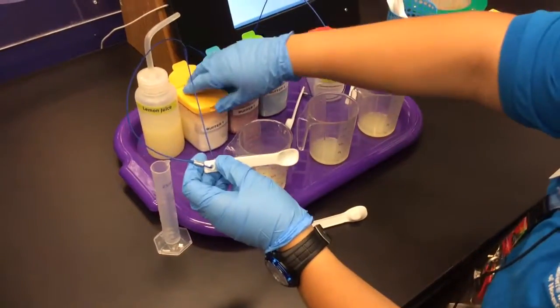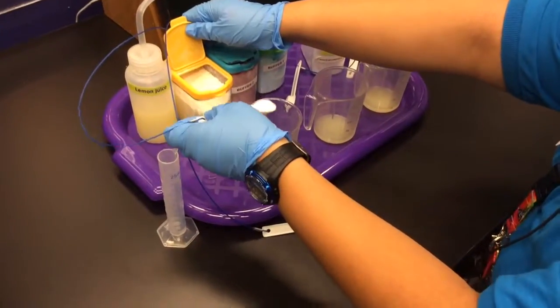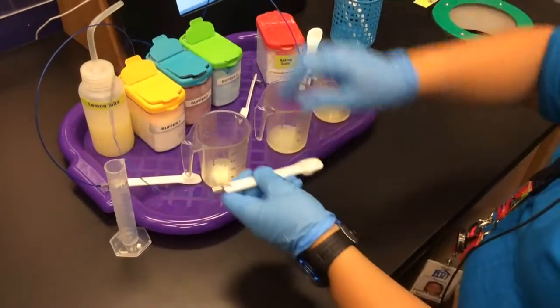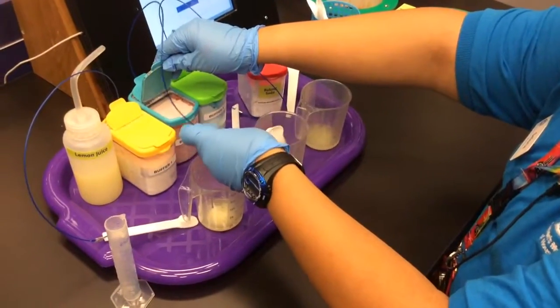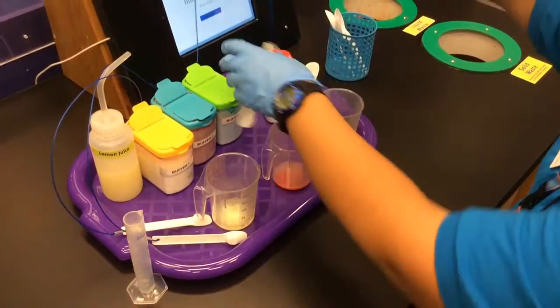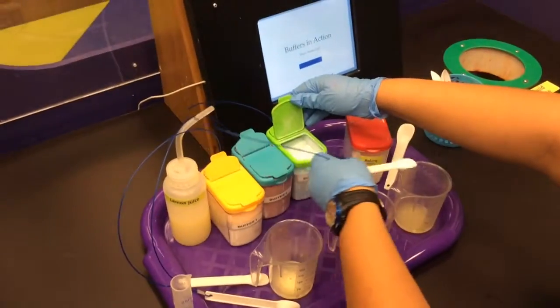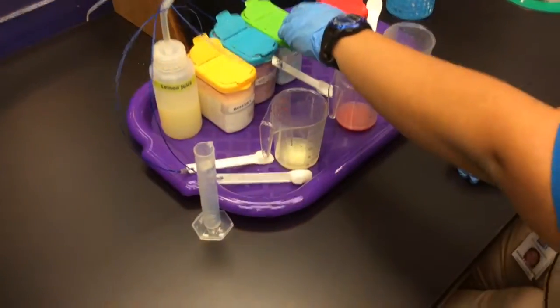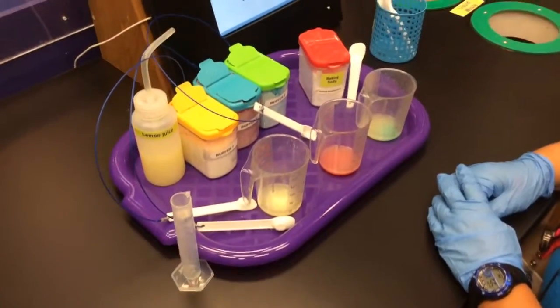So to our first beaker, we're going to add half a teaspoon of dry milk. Very good. And then to our second one, we're going to add half a teaspoon of Kool-Aid. Then we're going to add half a teaspoon of Gatorade to the last beaker. Okay, good. So we have half a teaspoon in each beaker. We have even measurements in all, so that means we're being consistent.